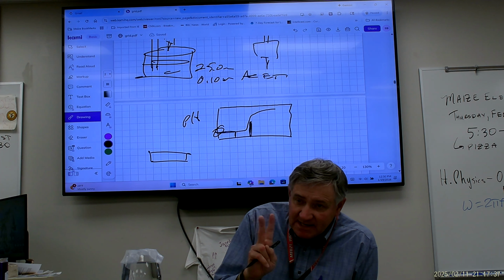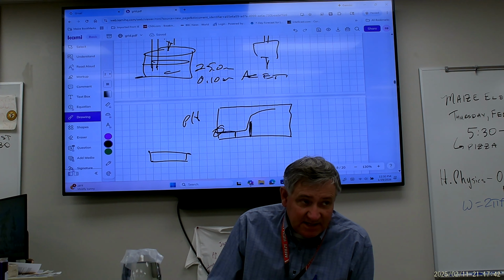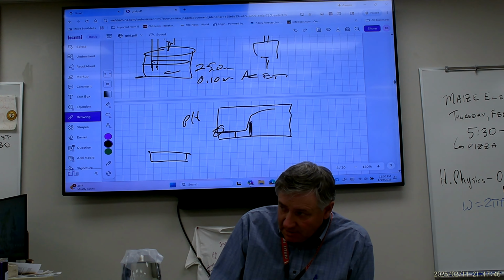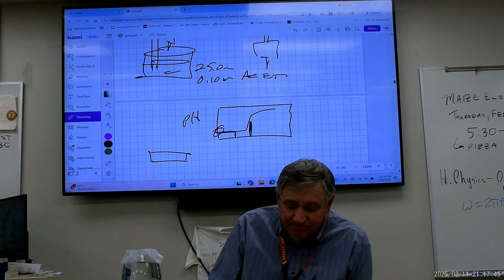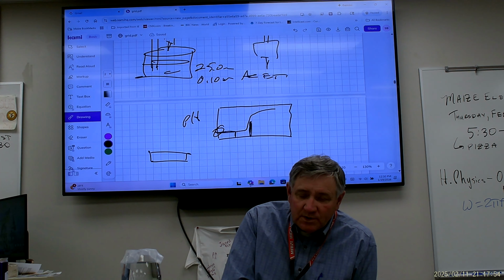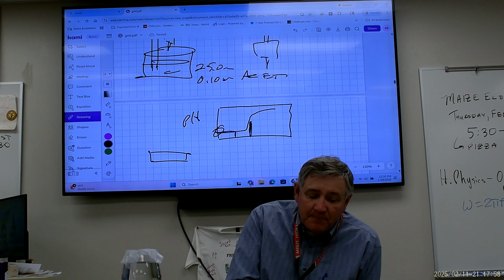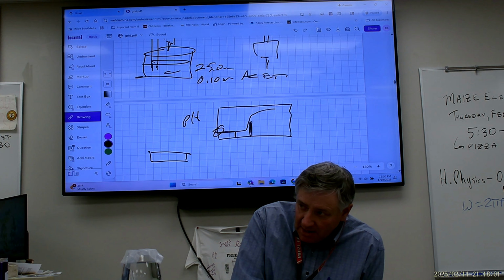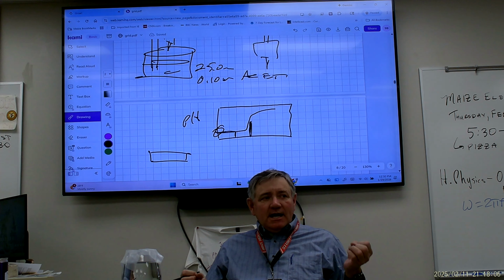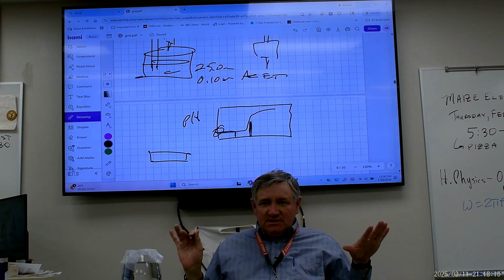So that's going to be your second titration. Your first titration is just straight acetic acid. The second one, you're going to start with 25 milliliters of acetic acid, but then you're going to add the sodium acetate to it. What you have to figure out is what the pH of that is going to be. But again, on calculation 1 and calculation 2, you have not added any hydroxide. This is just straight ionization of acetic acid.